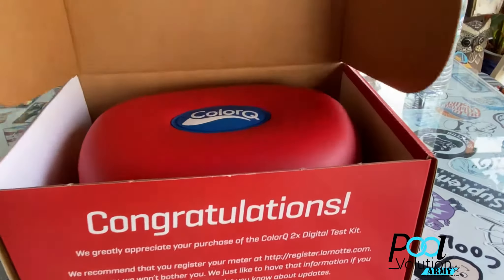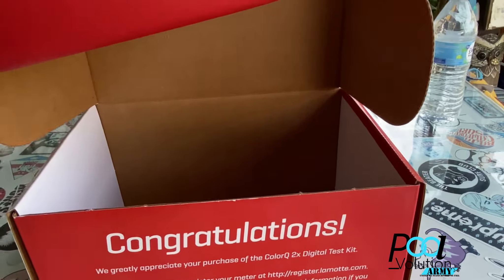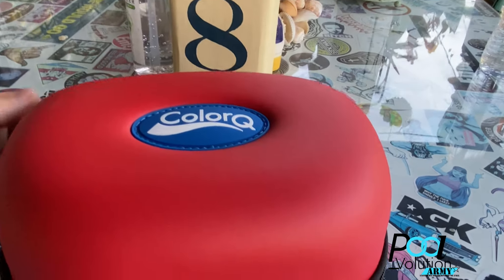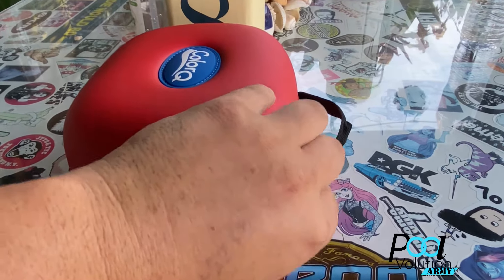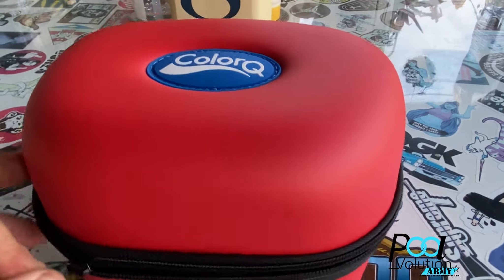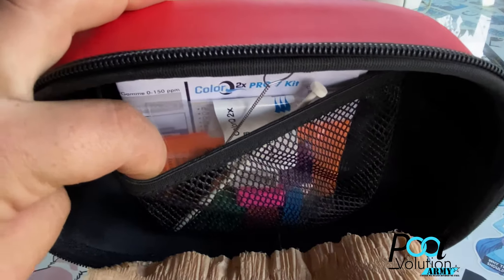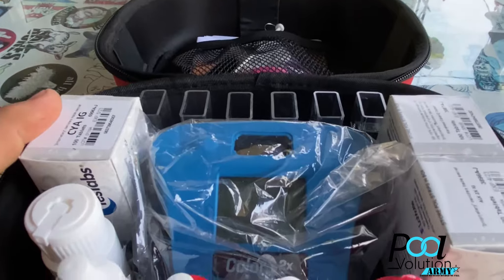This is pretty much the same thing as the Spin Lab, other than the ease of use is not quite as user-friendly as the Spin Touch, but I think you'll see it's really not that hard to handle — it's quite a bang for its buck. You can get one that tests for iron and copper; this one currently does not, but it tests for cyanuric acid, calcium hardness, total alkalinity, pH, bromine, free chlorine, and total chlorine. And hey, this wouldn't be a great review if we couldn't find out if this thing is truly waterproof, so here we go.